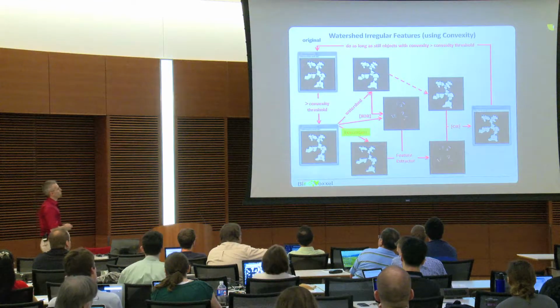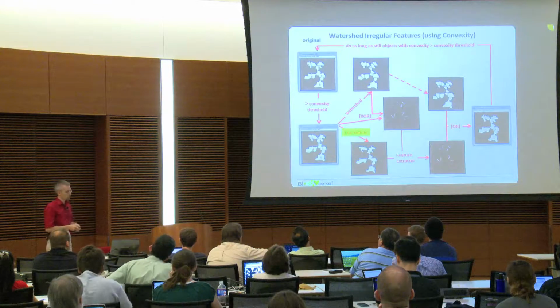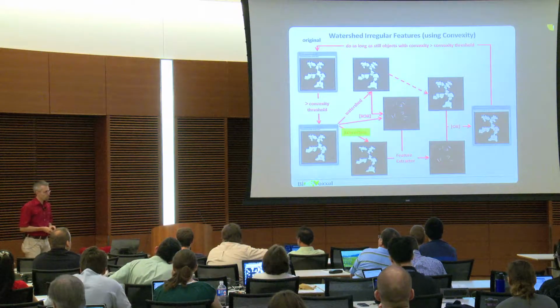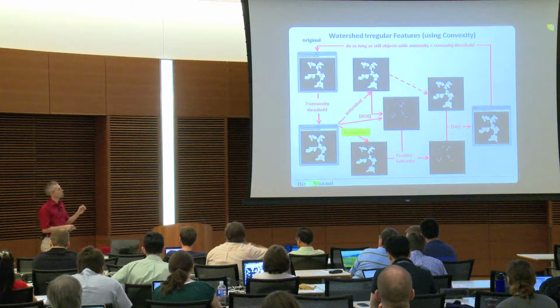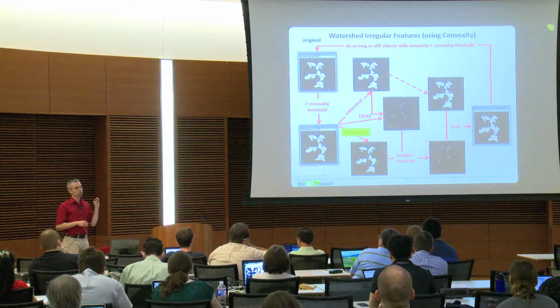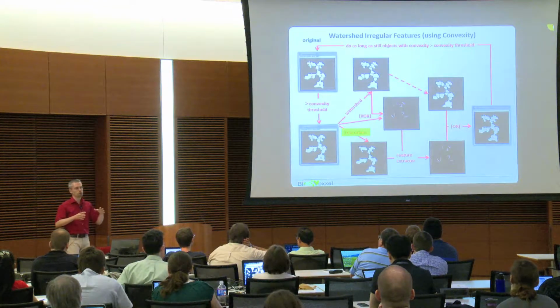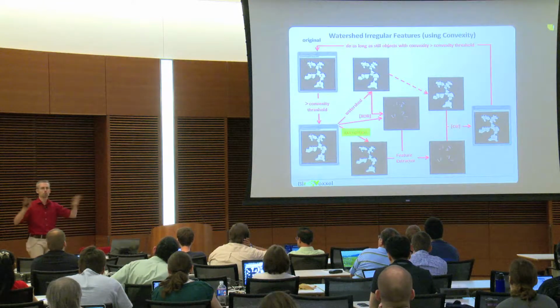So it's similar, but you can get different outputs, and sometimes one or the other works better. After the workshop there will also be an update, where I will add a possibility to choose the length of the separation, so you can specifically tell it to separate only where the separation line has so and so many pixels, which lets you modulate that in a better way.